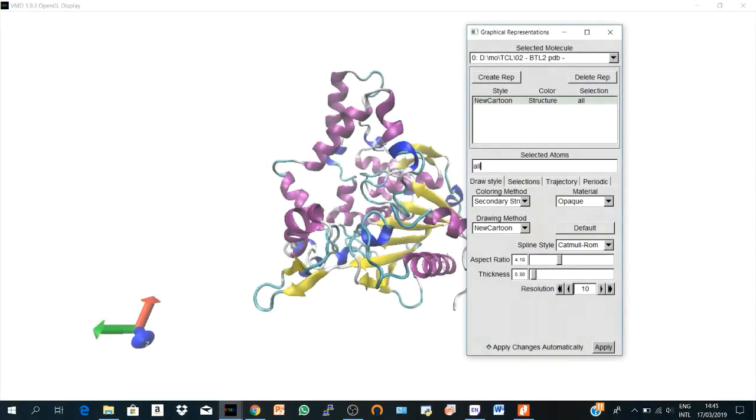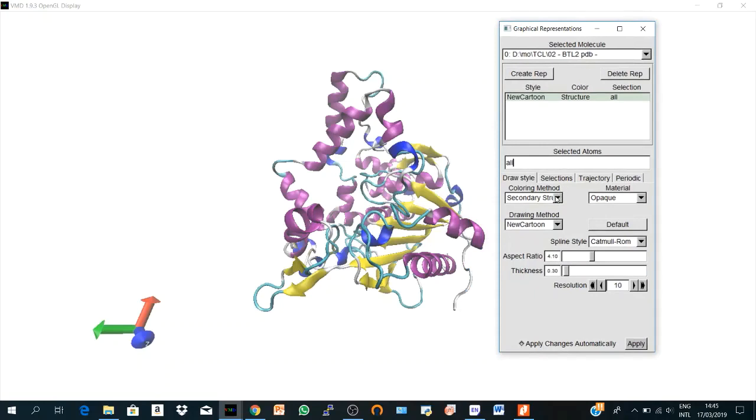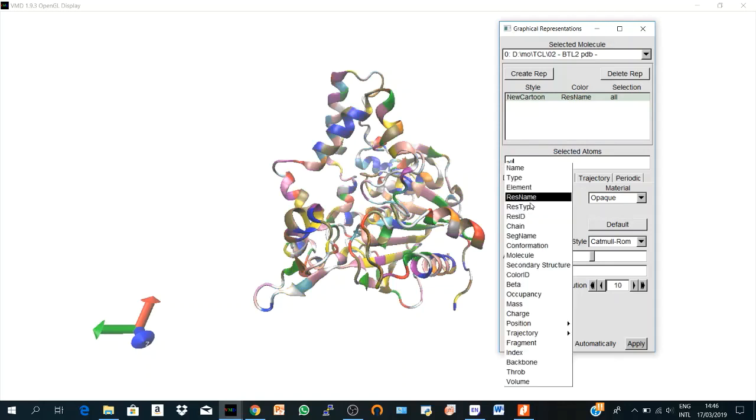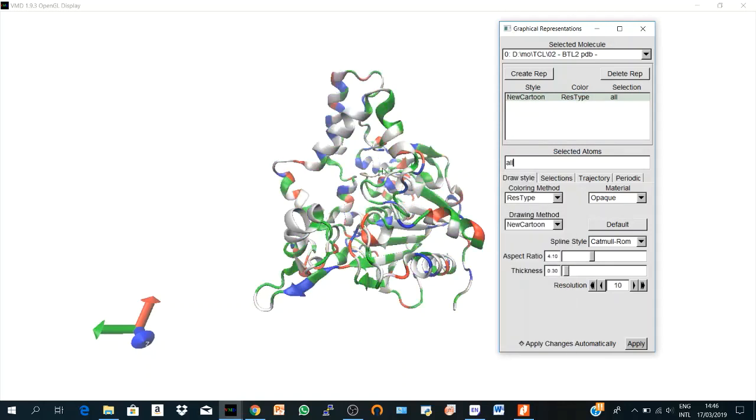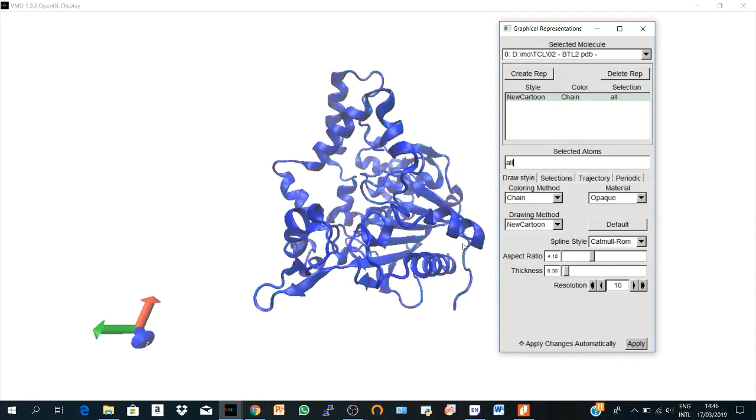We may change this secondary structure coloring method. It could be res name. Also it could be res type. So you see polar, non-polar, etc. And it could be chain. When you go for chain we got only one color because this structure is composed of only one chain. If you have two chains you can see different colors.